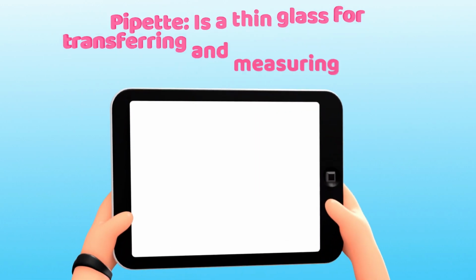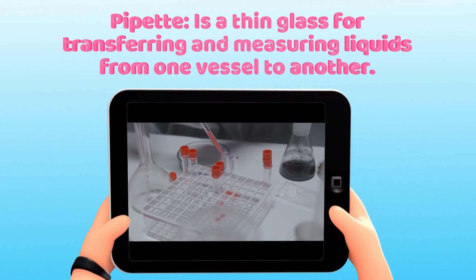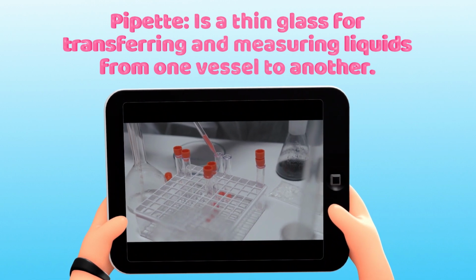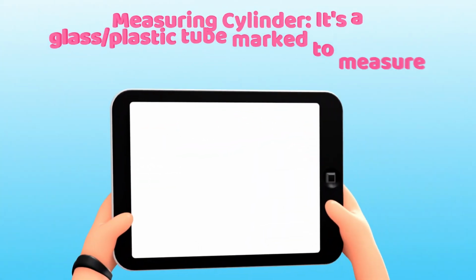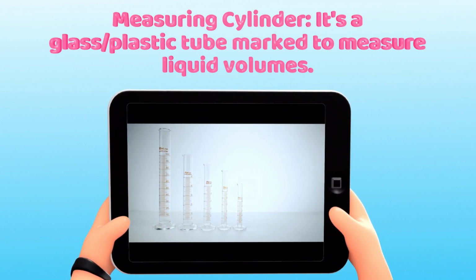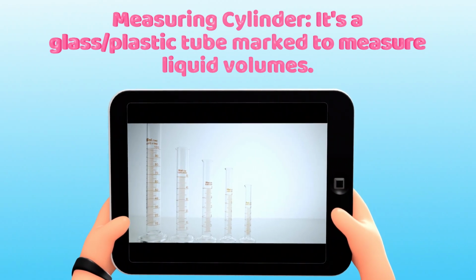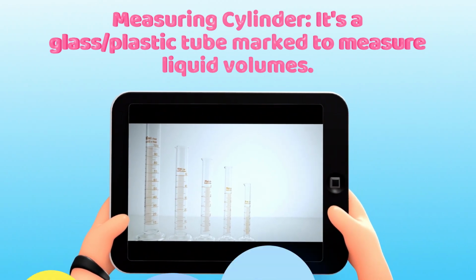The first one is the pipette, a thin glass for transferring liquid from one vessel to another. The second one is the measuring cylinder. This can be a plastic or a glass tube marked to measure liquid volumes.